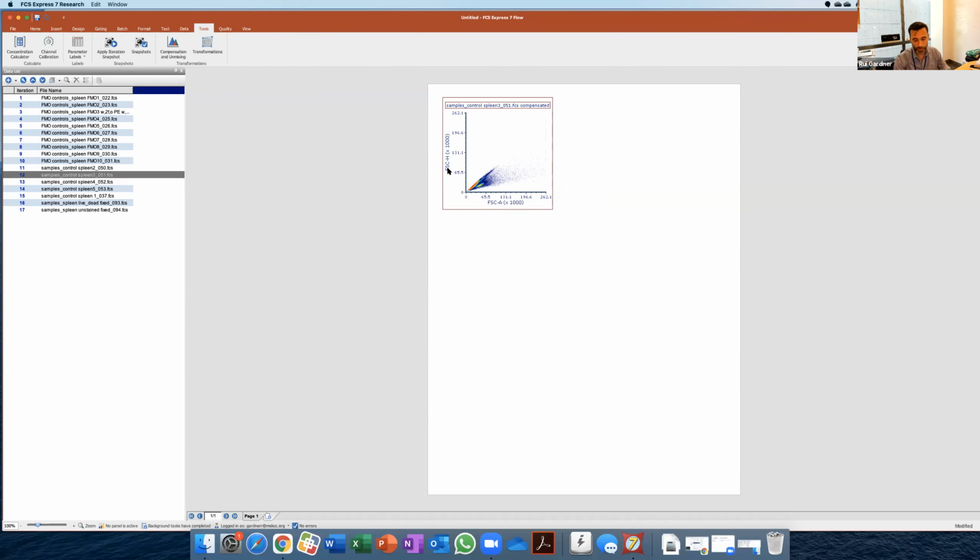One of the things we always try to convey is what the objective of this analysis is. You want to identify populations, and most of the analysis is really to clean up the data, to remove debris, remove dead cells, and make sure you're identifying specifically your populations and not anything else. You can start in any order.